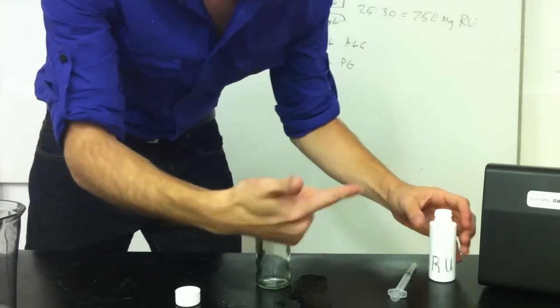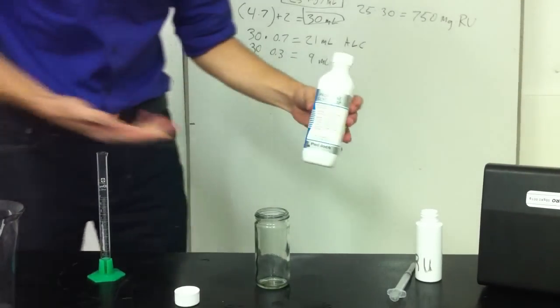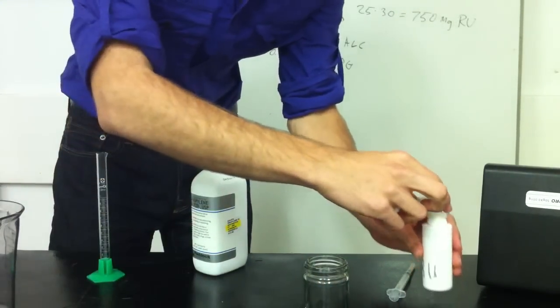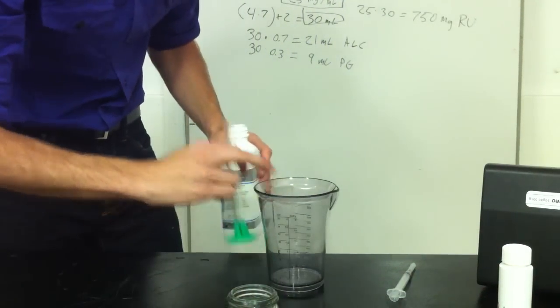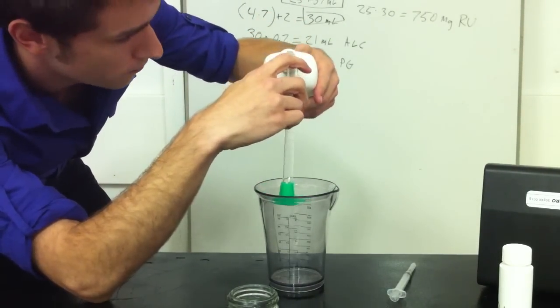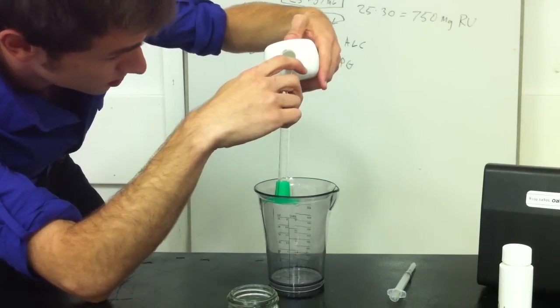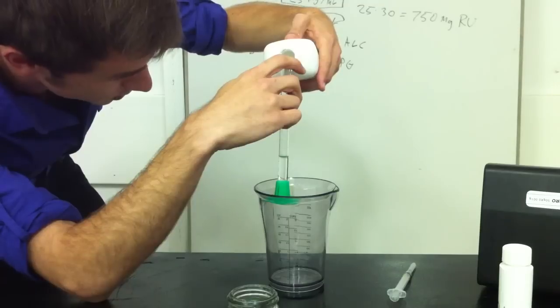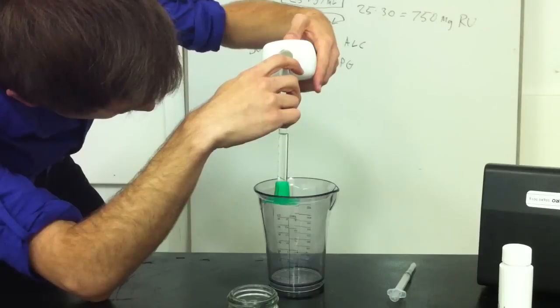So alcohol and RU is already in there. Now we need to measure out our 9 milliliters of propylene glycol. And I like to overshoot it a little bit because you know it does have a high viscosity and inevitably a lot of the propylene glycol will be left in the graduated cylinder. So I overshoot 9 a little bit, I'll do like 9 and a half.